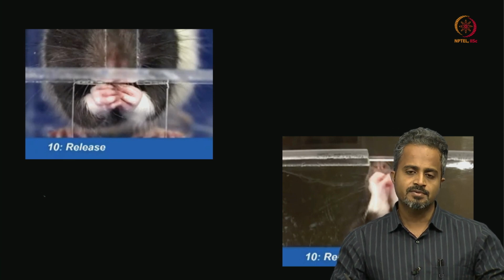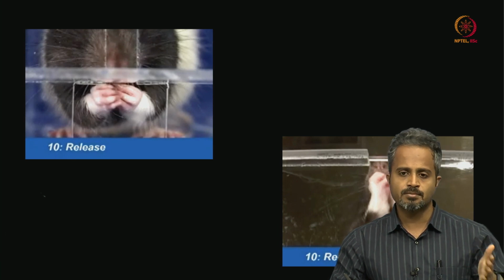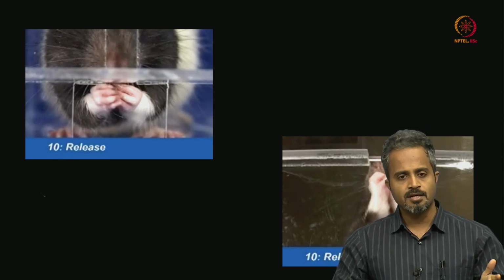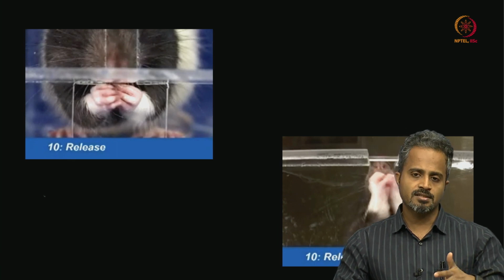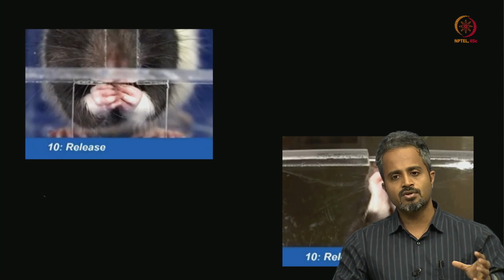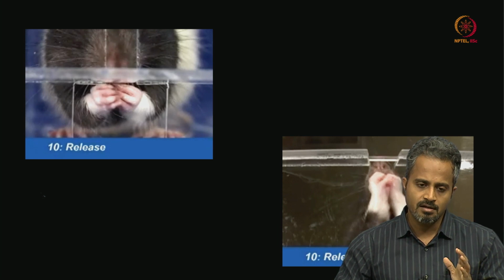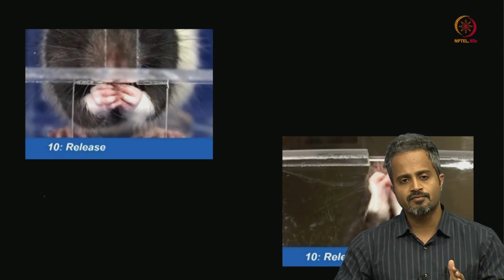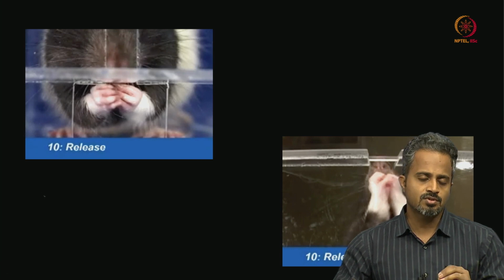Though there are 10 steps in the Whishaw test, if you do not get Long-Evans rats and are using some other species, or for that matter maybe the rat itself, but you are not seeing these steps consistently, then at least try to get 7 to 8 steps consistently, which is capable of reproducing itself every time you repeat the task. Those are the parameters that you need to choose.